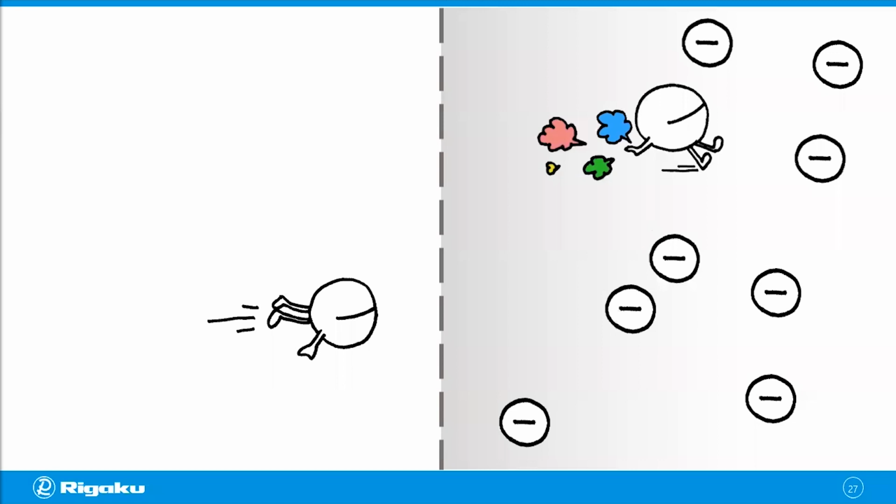Because this process happens gradually, different electrons slow down at different rates. The resulting X-rays have a wide range of energy. This is called Bremsstrahlung radiation. Sometimes people call this either continuous radiation or white radiation, again because of the wide range of X-ray energy.